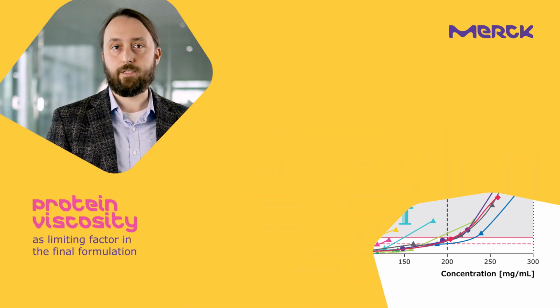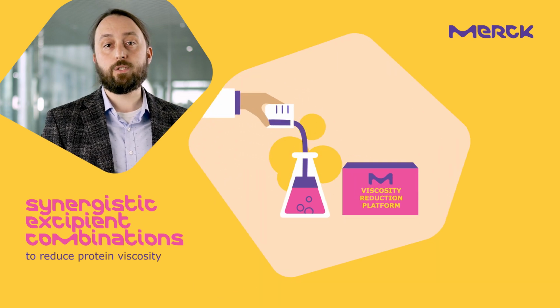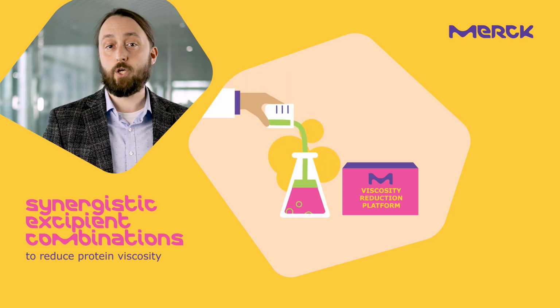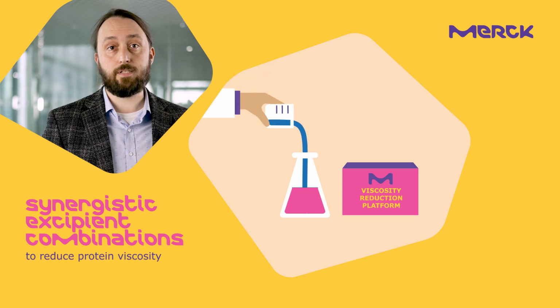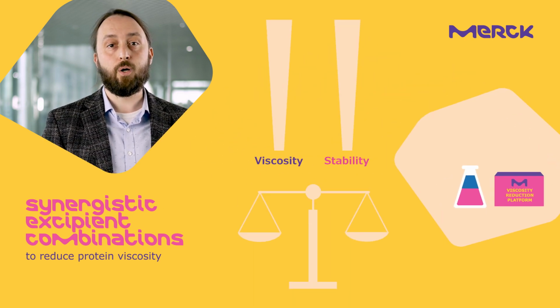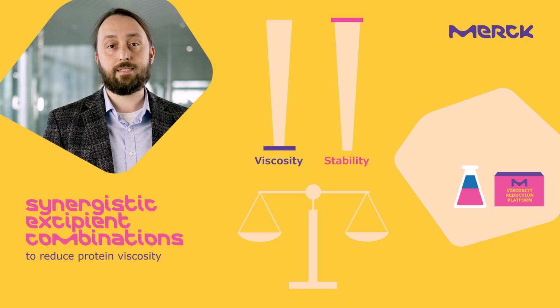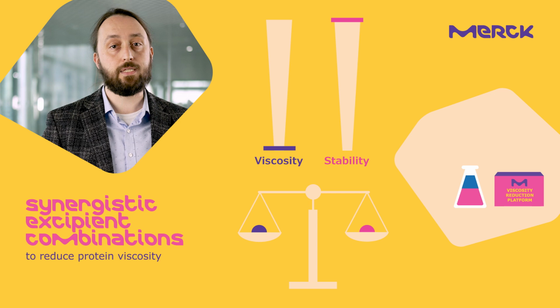So how can we overcome this issue? Let me tell you how we went about it in my lab to find a solution. First of all, we looked at the effect of different excipients and excipient combinations on proteins, on antibodies. This is important because the factors and the forces that cause protein viscosity on the one hand are the same that cause the protein to be stable as well. And this has led us to an important conclusion. We have to combine excipients in a way that protein viscosity is reduced, but that we can also stabilize the protein and balance these two factors, protein viscosity versus protein stability.